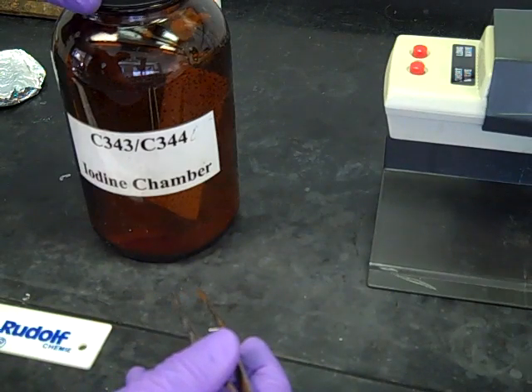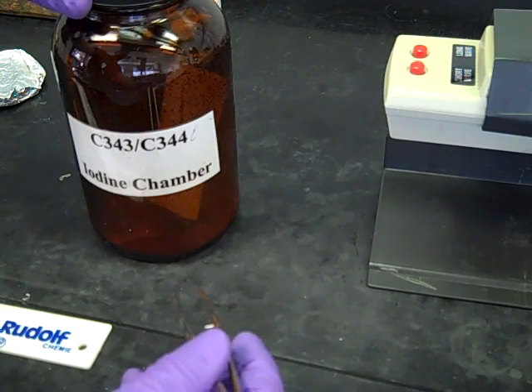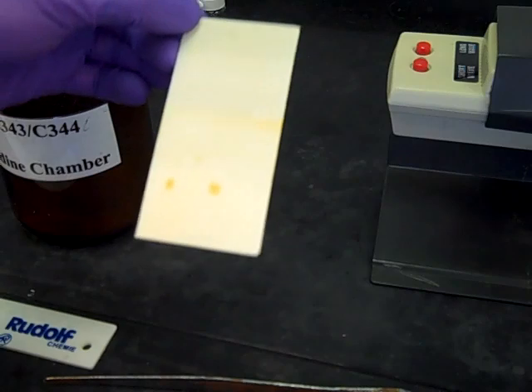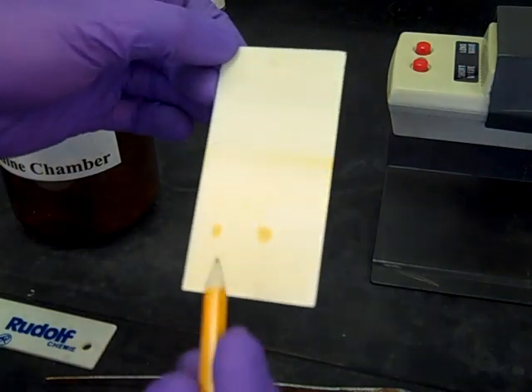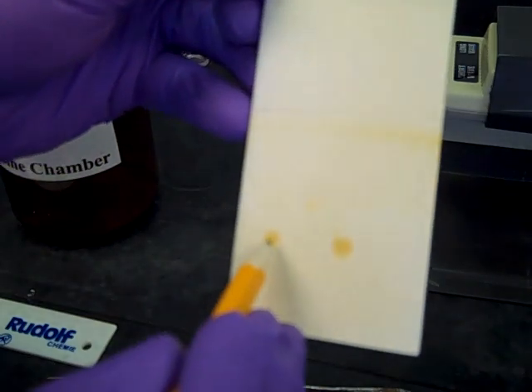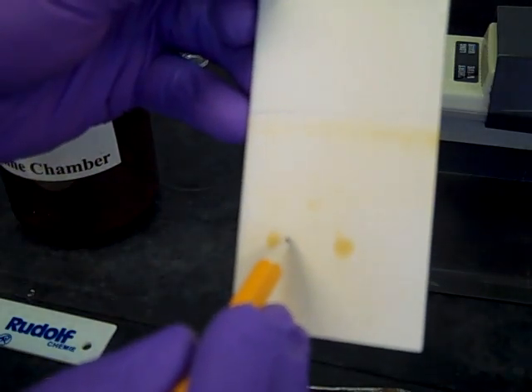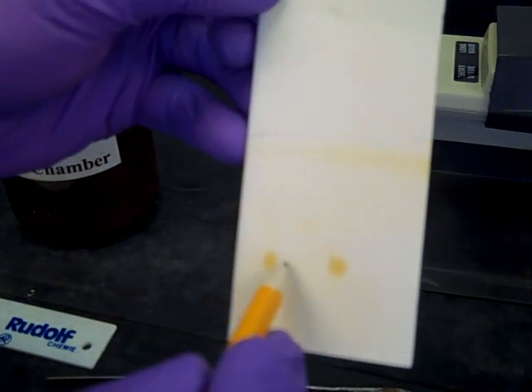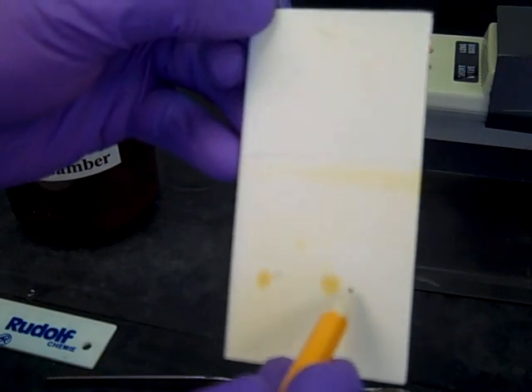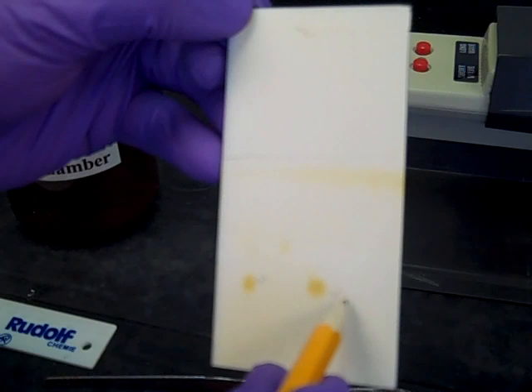As we take this out of the iodine chamber, we'll see a couple yellow spots that we want to notate. Make sure you mark that those spots have iodine stain.